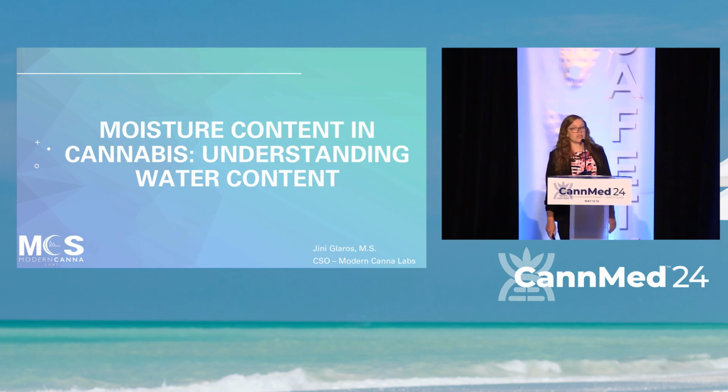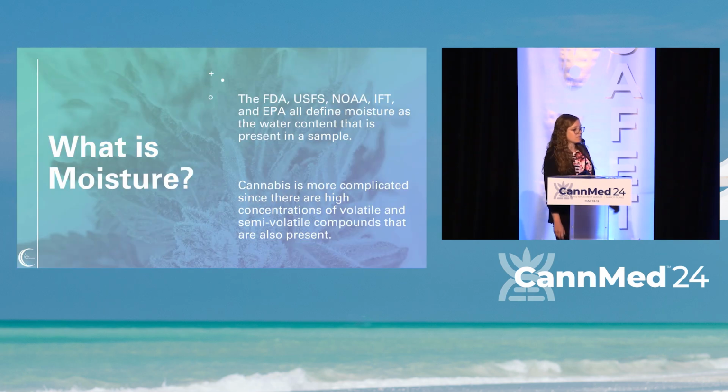Today I want to talk to you about a topic that I am very passionate about from the lab testing side of things, because I think it is very important for what we do in the industry and also very important for cultivators to be able to understand moisture content. So if you're a cultivator, a grower, a lot of labs are reporting anywhere from 12 to 15% moisture in flower, and a study we have conducted has proved that this may not be a true representation of water content in cannabis. So let's dive right in.